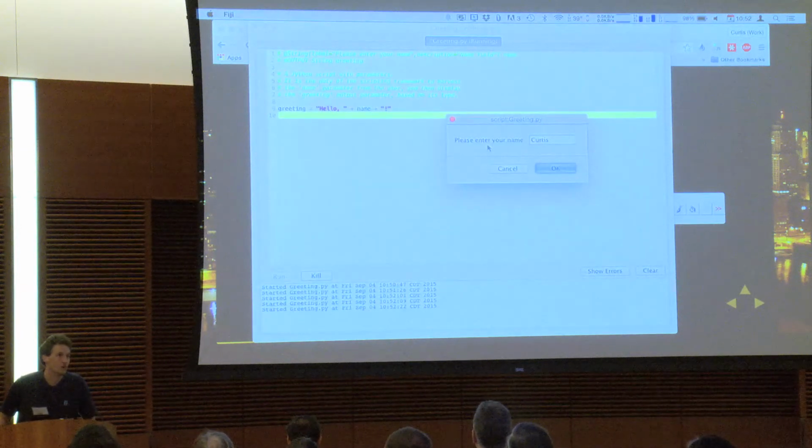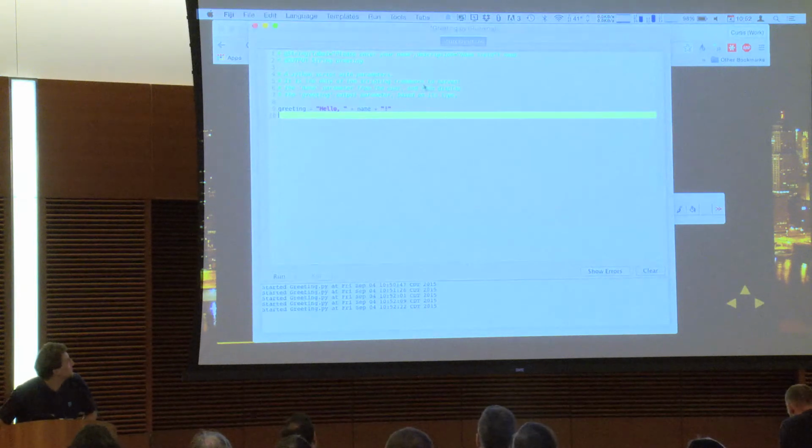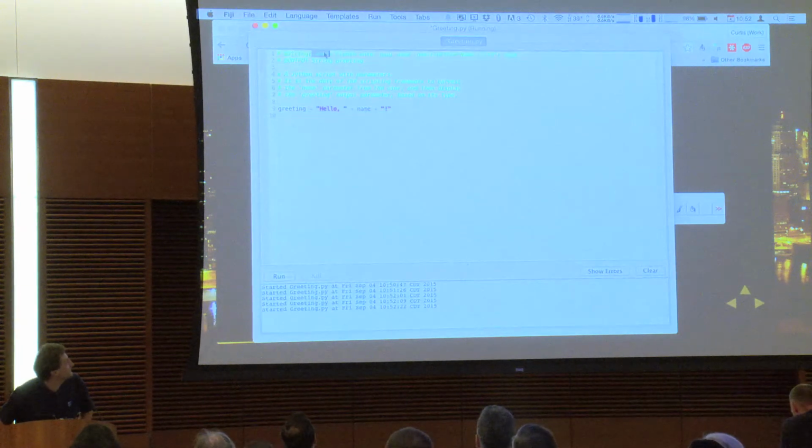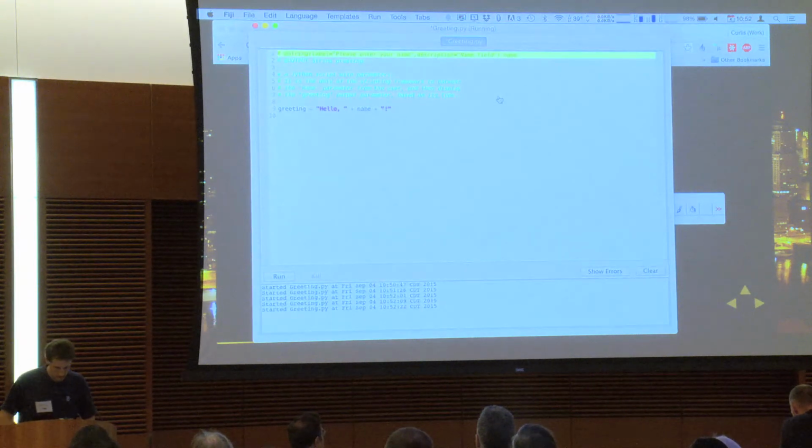So in ImageJ1 with generic dialog, there's a nice heuristic that you just use underscores and they turn into spaces, but this still doesn't give you full control over those labels. So if you want full control over those labels in the parameter framework, you can do it just by saying label equals. The descriptions right now I think are tooltips, but that could be changed in the future too. All right.